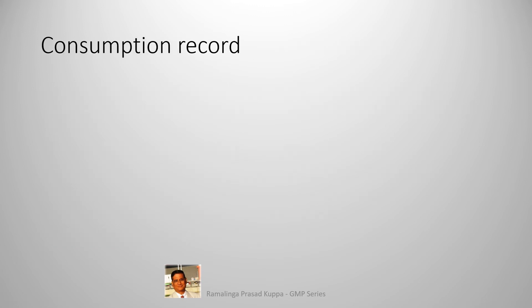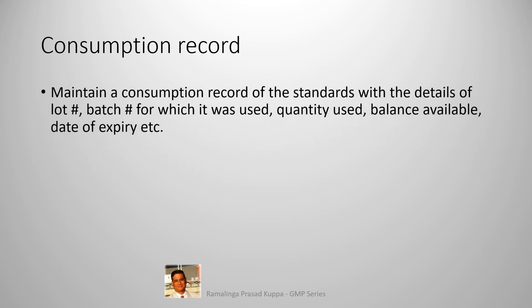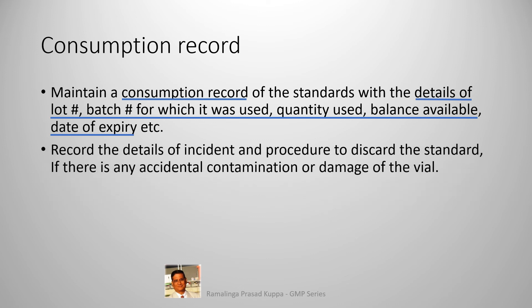Maintain a consumption record of the standard with the details of lot number, batch number for which it was used, quantity used, balance available, date of expiry, etc. This is to establish the usage of standards appropriately — it serves as a balance sheet of reference standard usage. Record the details of any incident and the procedure to discard the standard if there is any accidental contamination or damage of the vial, to establish that only uncontaminated standard is in use.